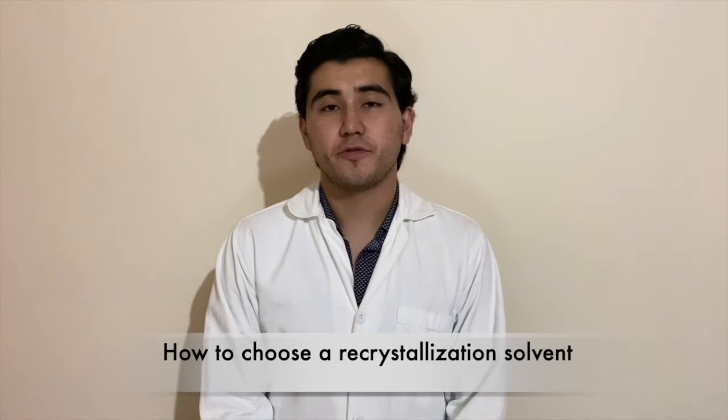How to choose a recrystallization solvent. A successful recrystallization depends totally on the proper choice of solvent. The compound must be soluble in a hot solvent and insoluble in the same solvent when it is cold. For the purpose of recrystallization, we consider 3% the dividing line between soluble and insoluble. If 3 grams of compound dissolves in 100 milliliters of solvent, it is considered soluble. If not, it is considered insoluble.